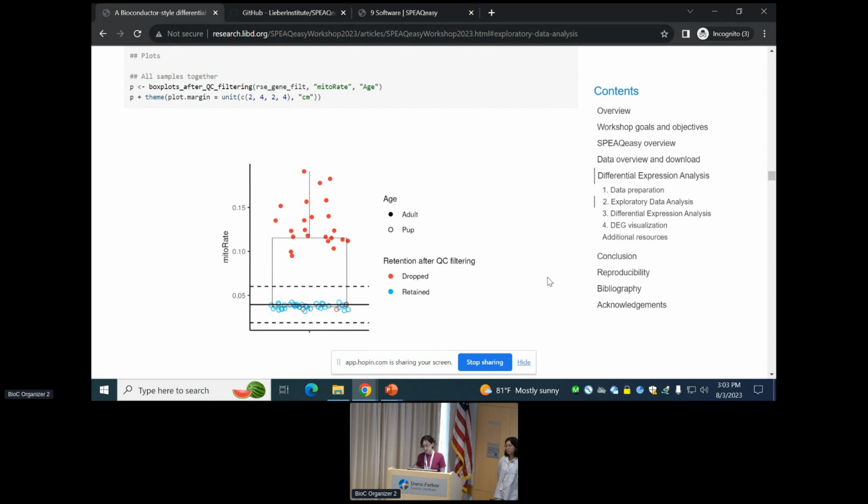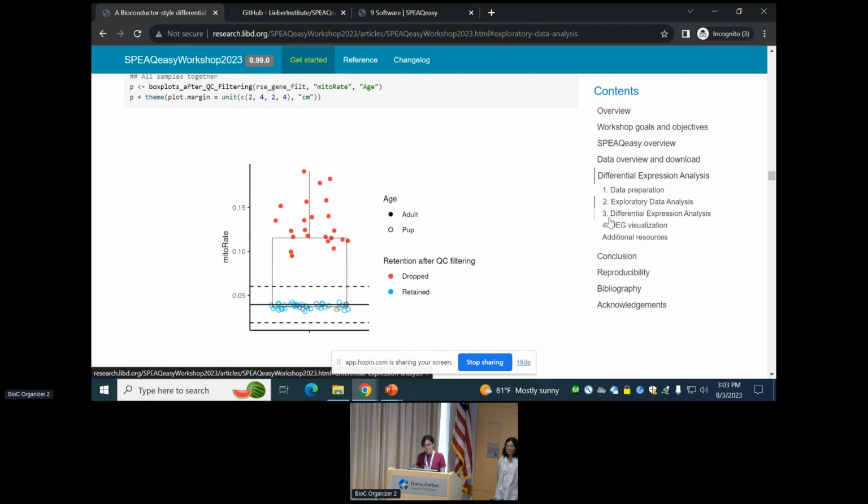Okay. I did think this was interesting because these are quality control scores that I typically might look at for single cell data, but I never look at them in bulk, mainly because I'm only working with 6 samples or 12 samples. So do you think the QC and filtering thresholds that you can use change depending on the number of samples that you have? Yeah, we only used this threshold with 3 median absolute deviations. We didn't try other ones, but it would probably be a good idea. Yeah, you do need more samples. Otherwise, the isOutlier function with only 6 samples is not really meant for just 6. It's meant for a lot more.